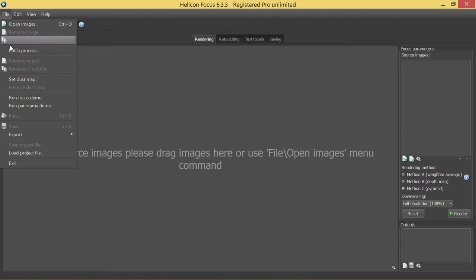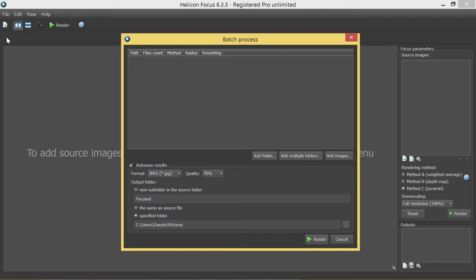There are several ways to add a stack to the queue: to add images or to add one or multiple folders. Depending on what you need, press the relevant button and choose images or folders to be added.